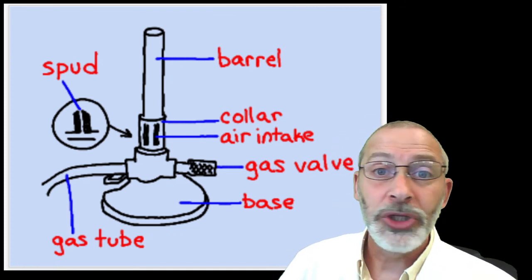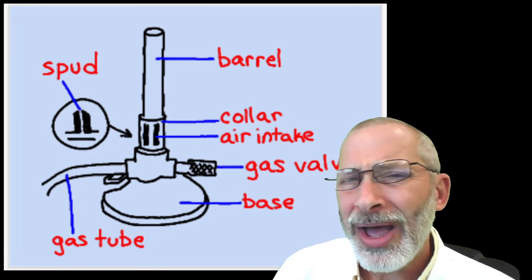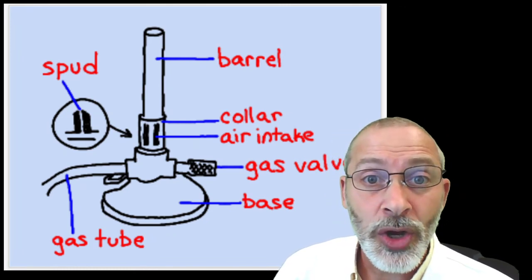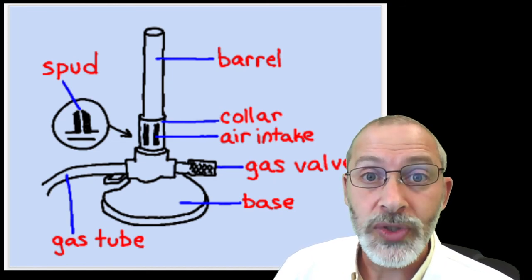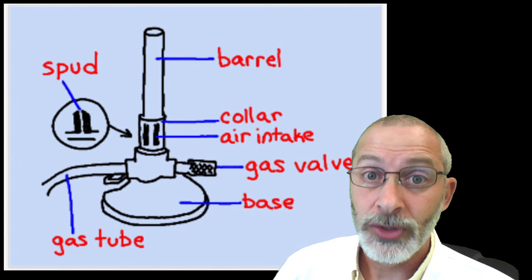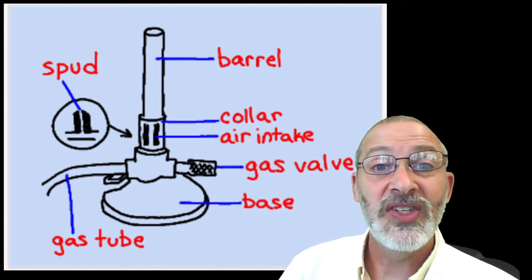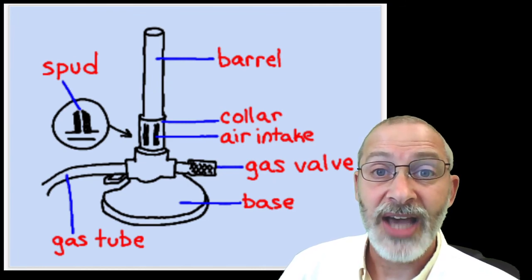You won't be able to turn to your book and say, oh, what was the collar again? How do I adjust the gas valve? What's the gas valve? You need to know these terms before we use the burners. So your homework for today, no matter what else you do, is to study and memorize this diagram.